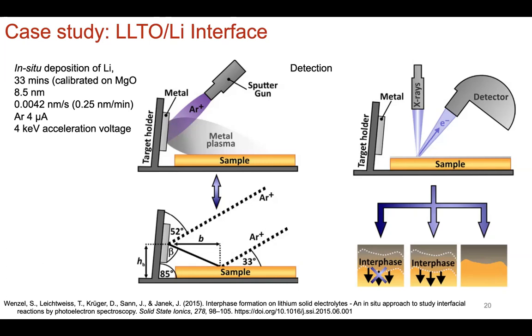So this is extremely useful for people developing interfaces and trying to form formulations for, let's say, artificial SEI, because if you know what's going to form and if it's useful, as in it's ionically conducting, then you might want to just form the artificial SEI because it's thermodynamically going to get there. Okay.